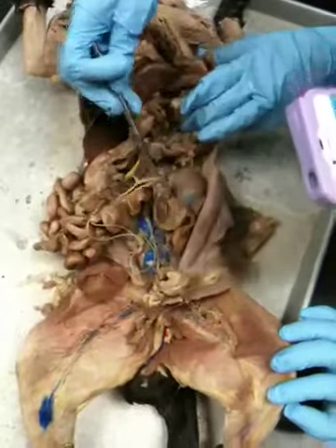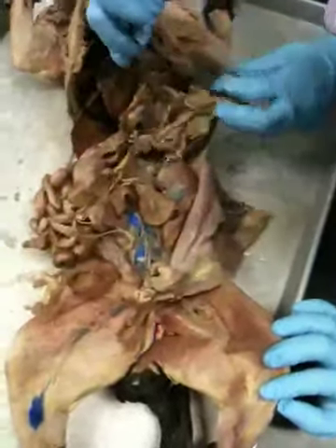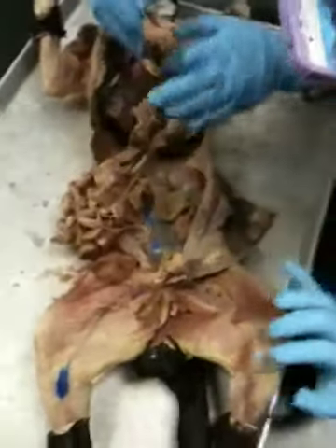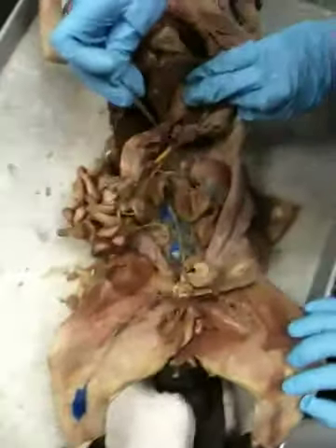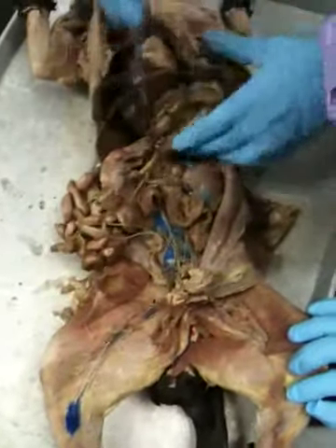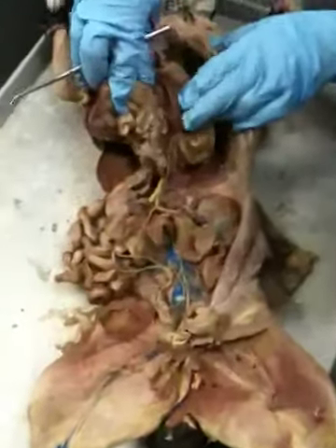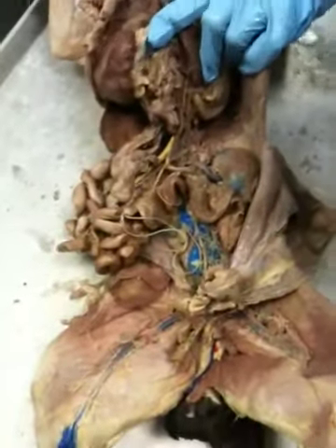Oh, okay. I was wondering, is that the stomach? Yeah, the stomach's right here. Ours is ripped open because we had it laid out so you can see the rugae. And this thing here is the hepatic portal vein. It's the portal at the bottom of the liver and then it's the vein at the top.